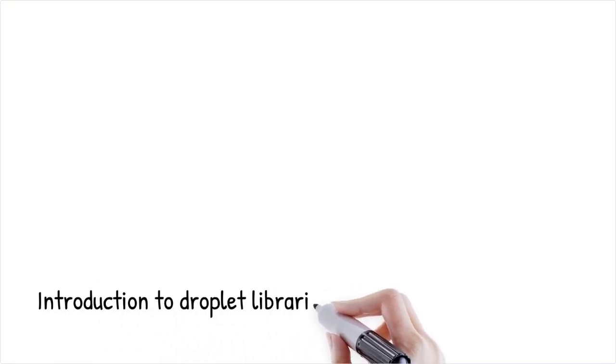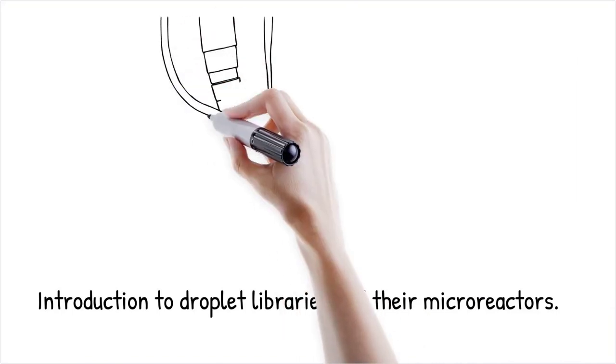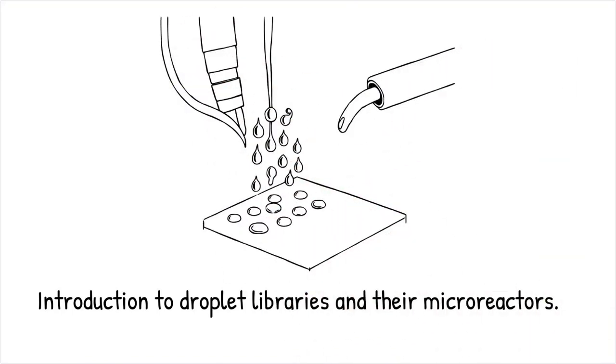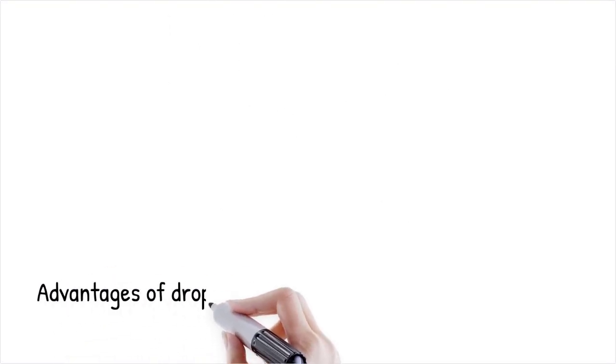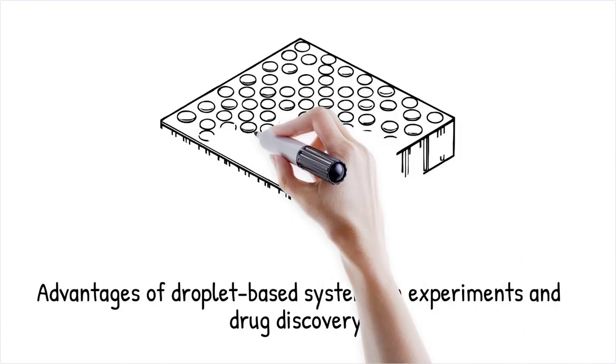Droplet libraries consist of millions of microdroplets, each acting as an independent microreactor containing different chemical compositions, biological samples, or nanoparticles. These droplets are generated using microfluidic devices where fluids are precisely manipulated under laminar flow conditions. The advantage of droplet-based systems is their ability to miniaturize experiments, allowing for massive parallelization and high-throughput screening.